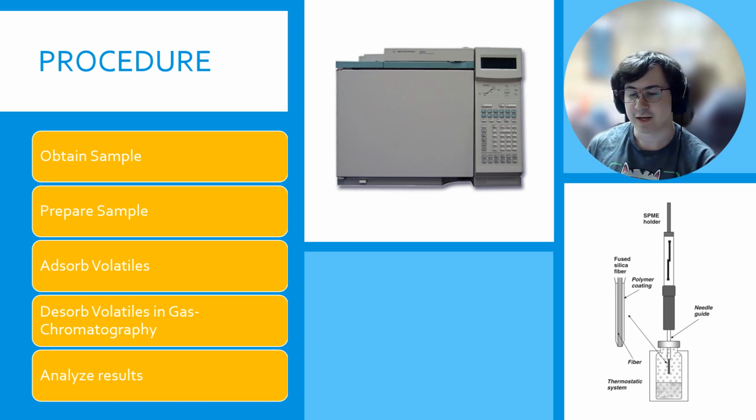We use the flame ionization detector, or at least I did, because it gives concentrations and it's a little easier for us to run, because the mass spec requires a new septum after every use. Otherwise, we leak a lot of helium. The FID does not appear to need that. Well, it's not the detector, it's the gas chromatography machine that's coupled to the flame ionization detector. But we are thinking about maybe moving towards using the mass spec more, because it gives better fragmentation patterns, which is better for determining unknowns, which is what we would be doing with actual dog urine.